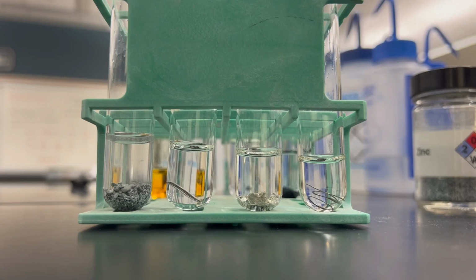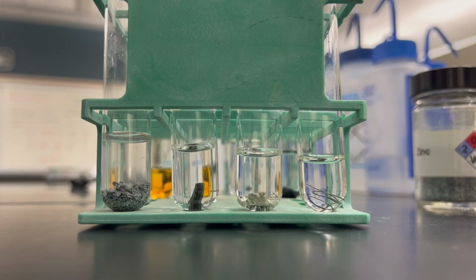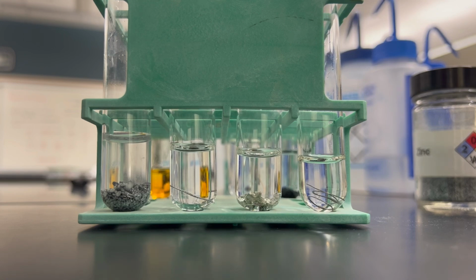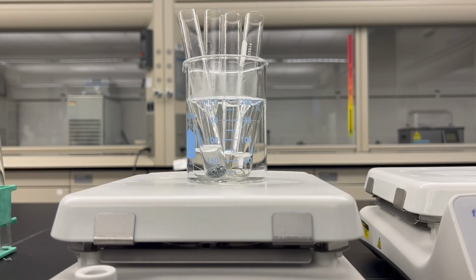So these have been sitting for about 5 minutes, and nothing really has happened so far. There's no production of bubbles, there's no degradation of our sample. So what we're going to do is put these into a hot bath so that we can help the reaction move forward.